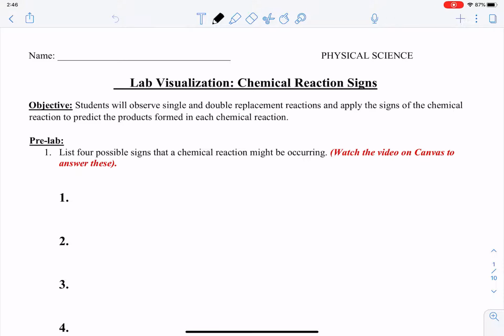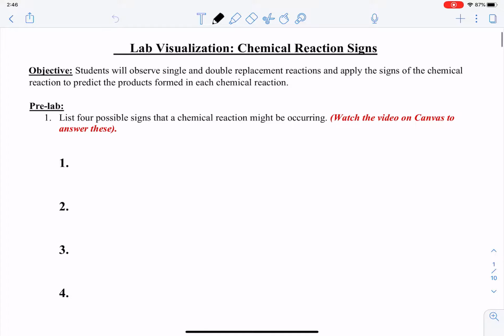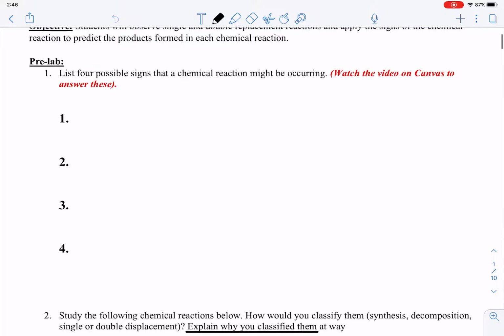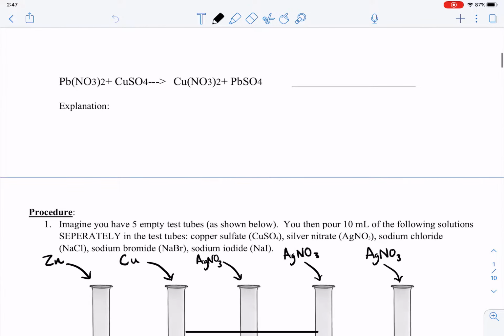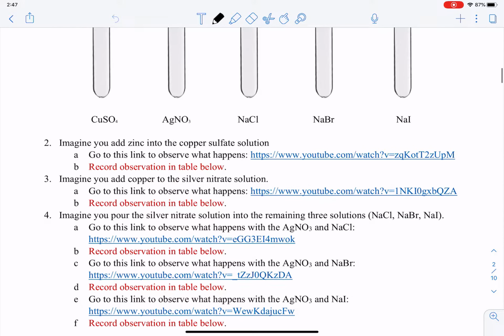Hi guys, this video is to go over the chemical reactions visual lab, and we're not going to go through the whole thing together. For example, for our pre-lab, there is a video I already made that goes over four possible clues or signs that a chemical reaction has occurred, so watch that, which will help you answer the pre-lab. And all of this you can do on your own. Just make sure you follow the links and you read the directions carefully.